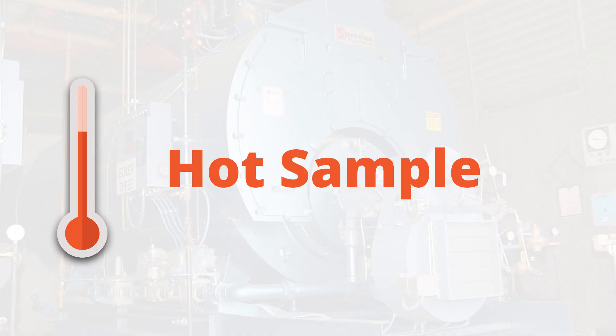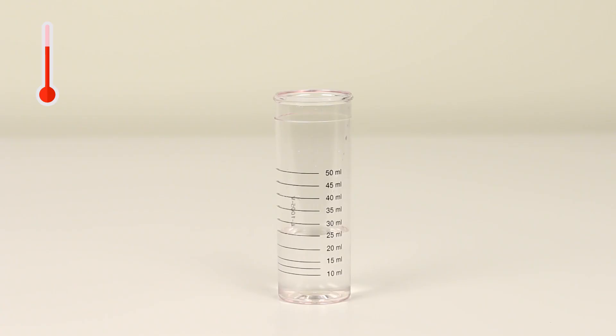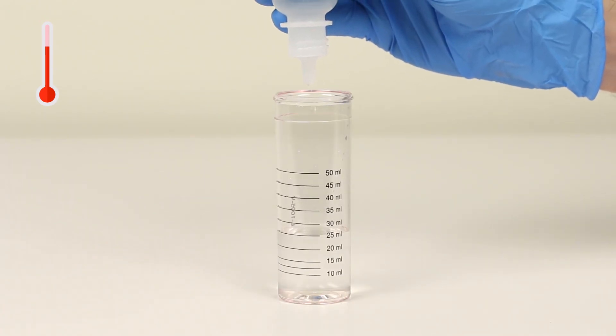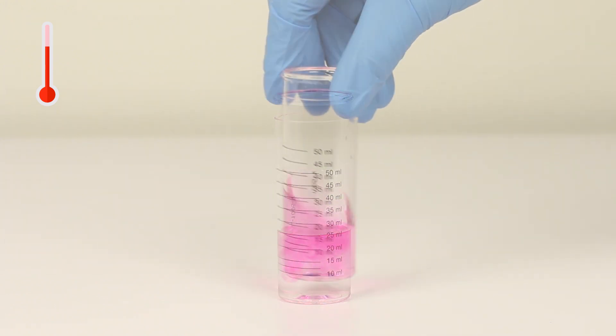We will now run the same test on a hot sample. Add one drop of phenolphthalein indicator and swirl to mix. The sample should turn pink.